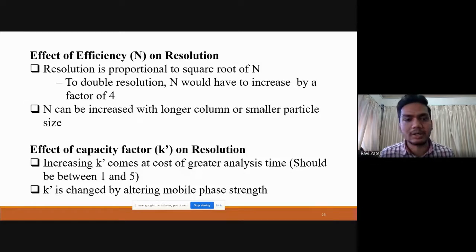So by this way we are increasing interaction of our mixture of compounds with the column and separating it out at a different RT, right? So it is in our hands which length and which particle size we can use, according to the separation and the resolution we want. We are just changing the column length and particle size during the method development.